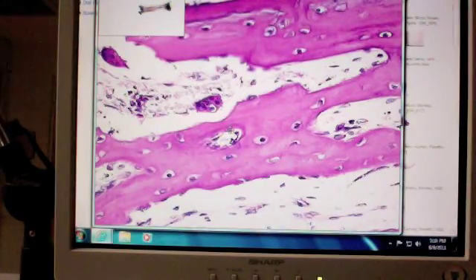Okay, yes? Can you show us endosteum again? Okay, so endosteum, all of this surface that you can see along here, all of that is endosteum. And this is cancellous bone. This is cancellous bone, correct? So if I said name the tissue, be specific, cancellous bone would be good.